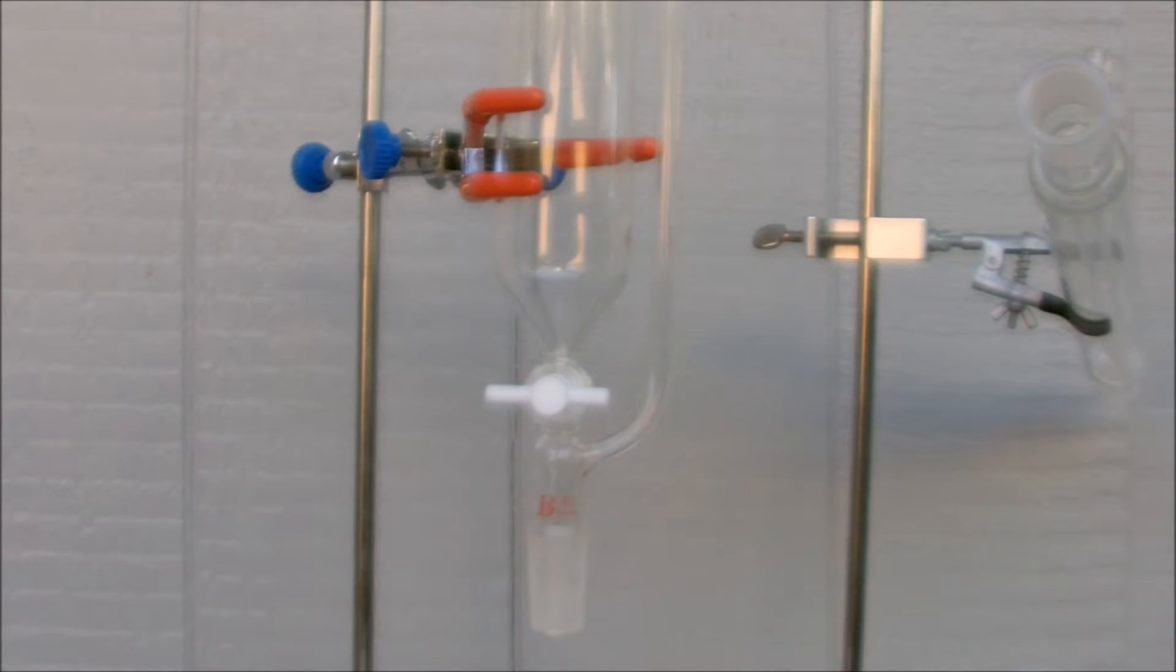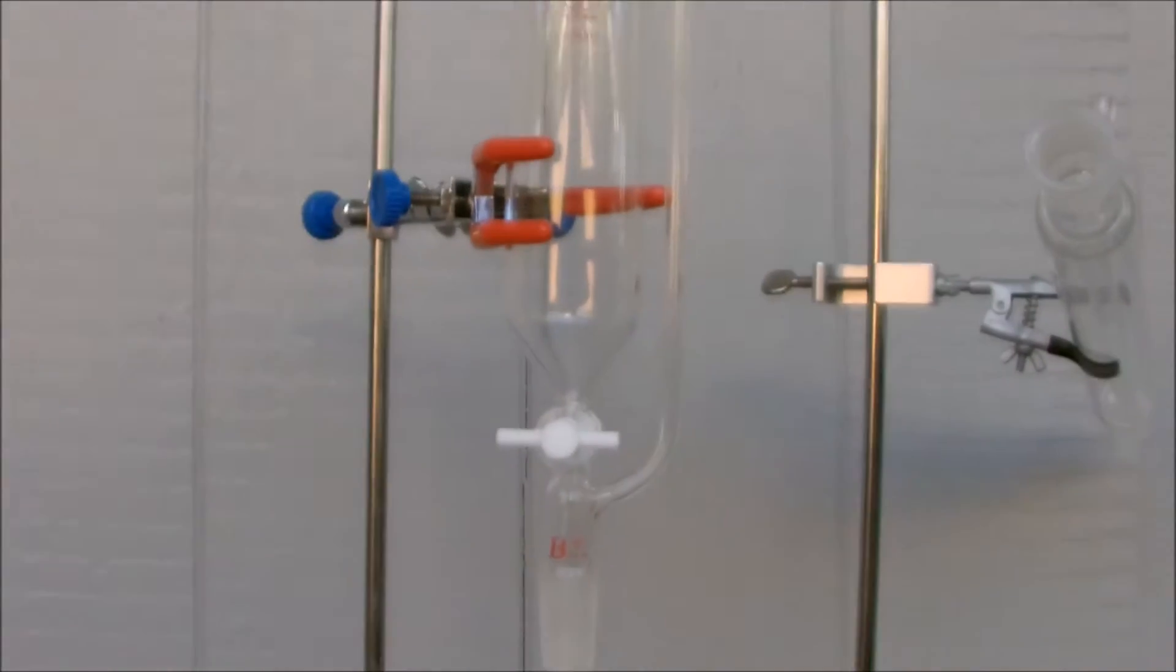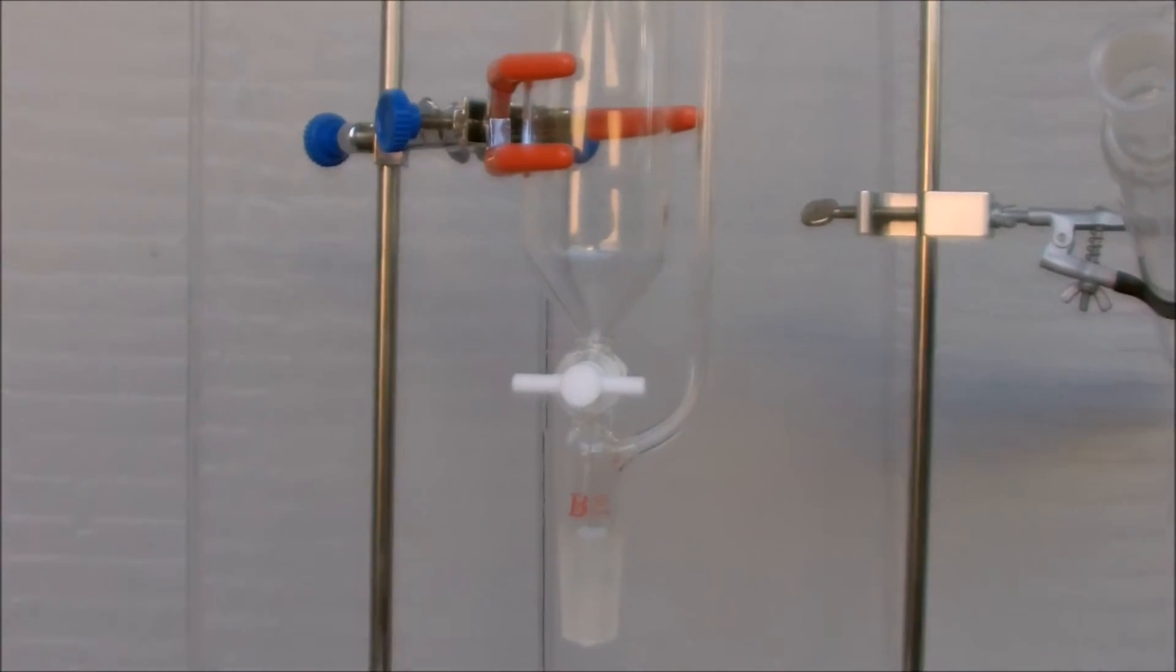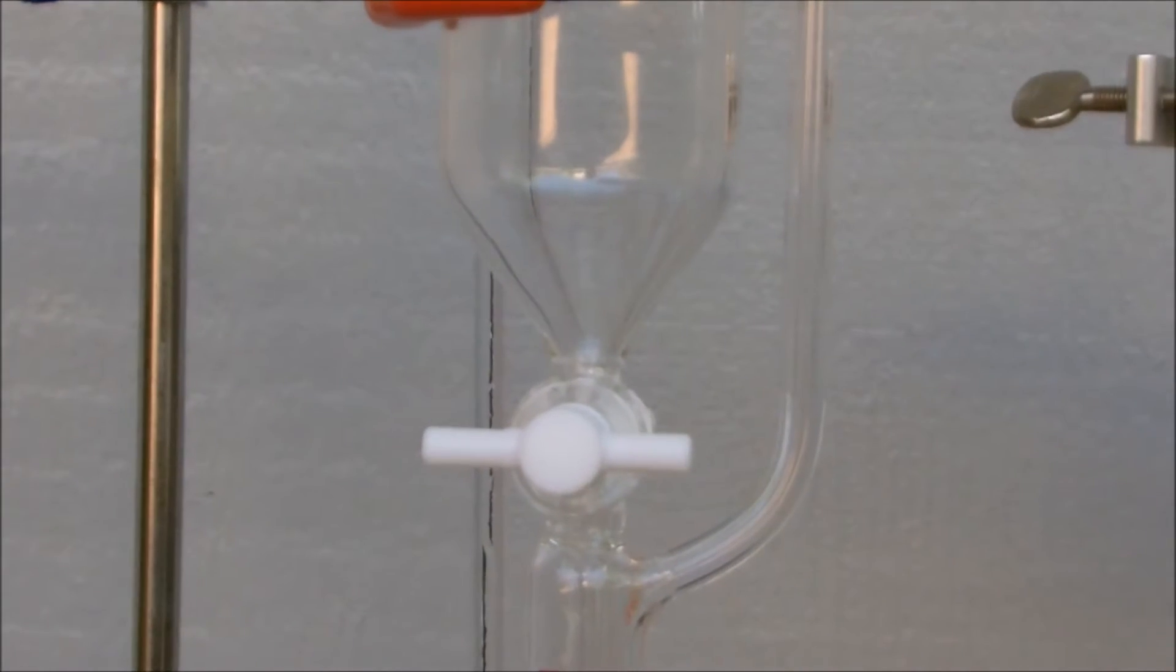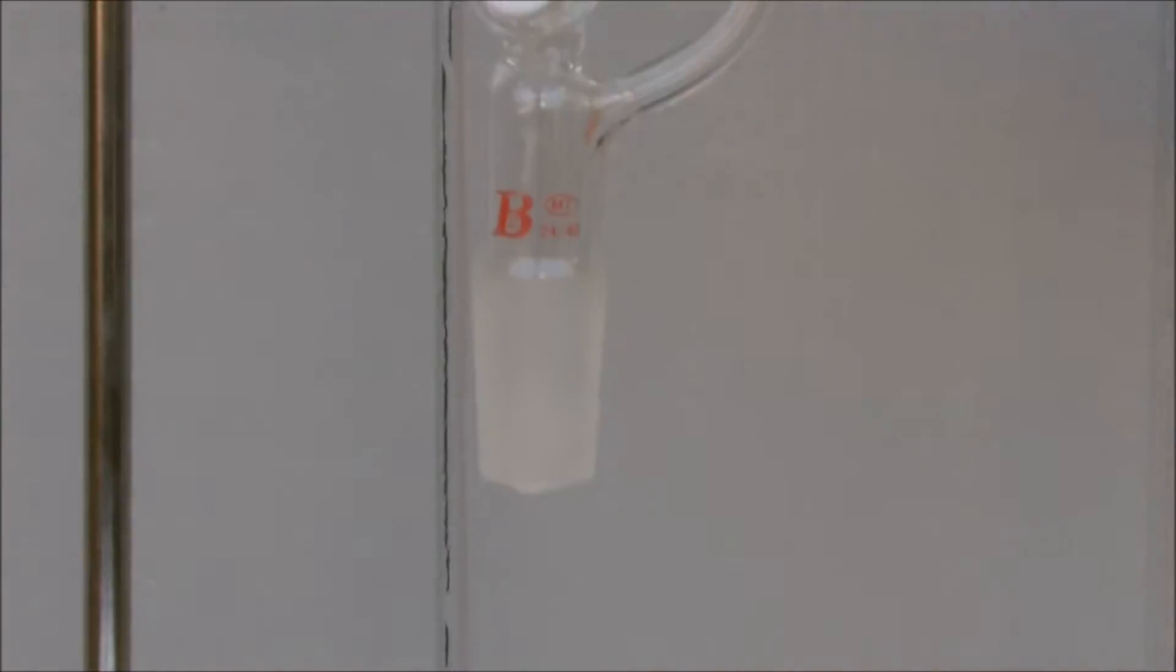Now that we have it clamped up, we can measure out the hydrochloric acid and put it in here. Make sure that the stopcock is perpendicular to the flow of liquid.